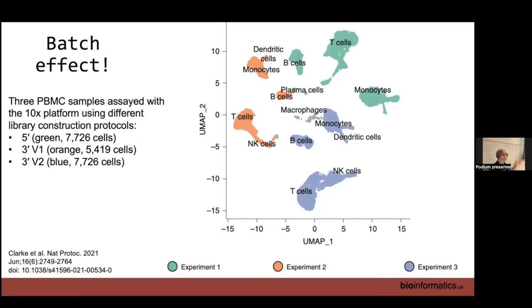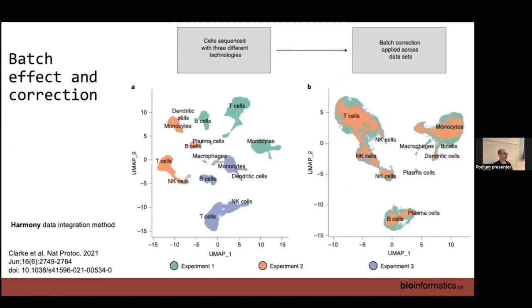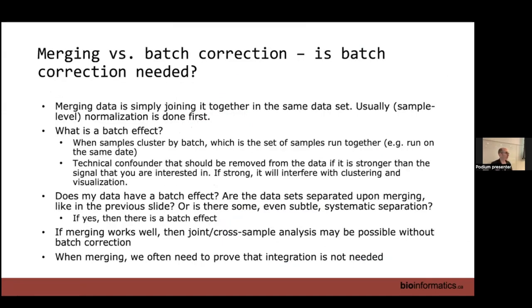This example is from our Nature Protocol. There's a 10x platform with five-prime, three-prime, and two versions of three-prime, and there's a pretty strong batch effect between these technology choices. Fortunately, batch correction exists as a method and we can go from cells being separated into three different technologies on the UMAP to everything being nicely organized by cell type. The particular batch correction method applied here is Harmony, and we were able to fix this problem.